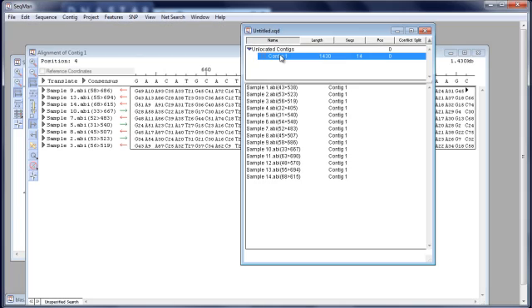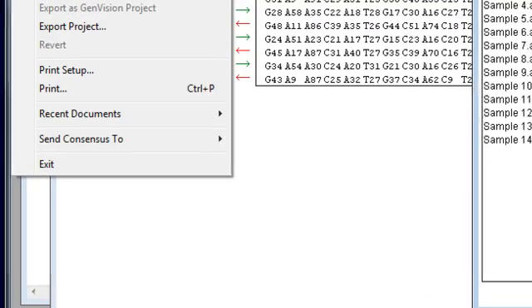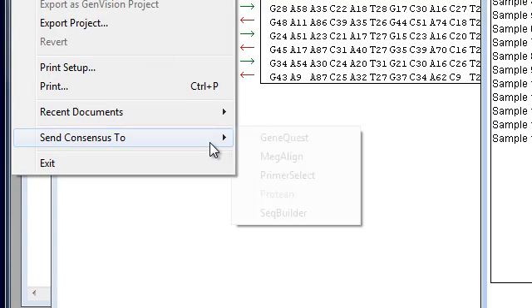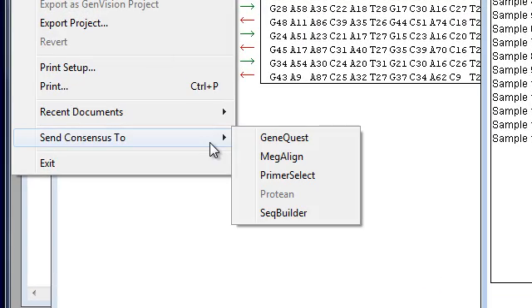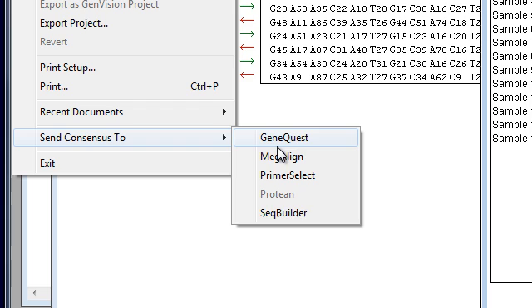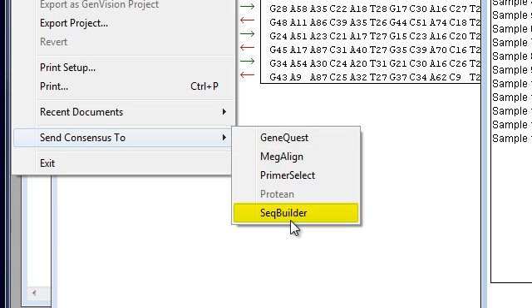After assembly in SeqMan Pro, you can send your consensus to another LaserGene application by using the send consensus to command. For example, we can send our consensus to GeneQuest to perform gene discovery or to SeqBuilder to perform further annotation and sequence editing.